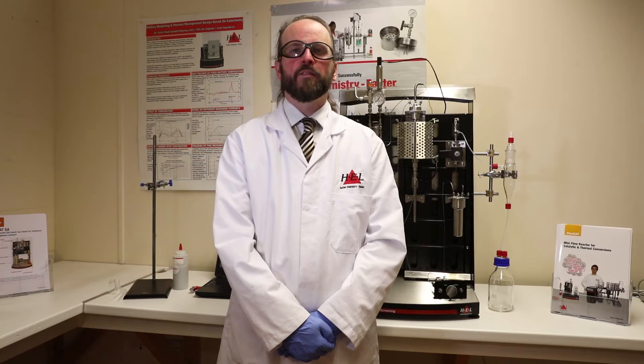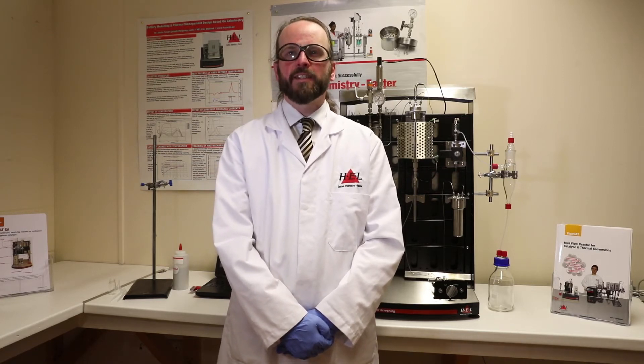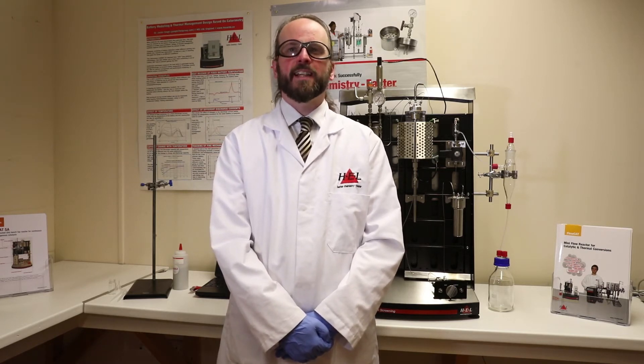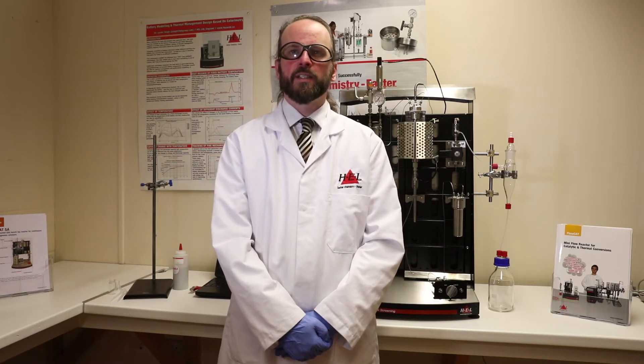The Flowcat is a benchtop fixed bed reactor system. We designed the Flowcat to be a scale-down version of industrial fixed bed reactors that have been used in industrial processes for decades for tonne scale production. As a result, the Flowcat is a fully scalable flow chemistry system. In fact, many of our early customers bought a Flowcat as a model of existing plant to further develop their processes and catalysts.